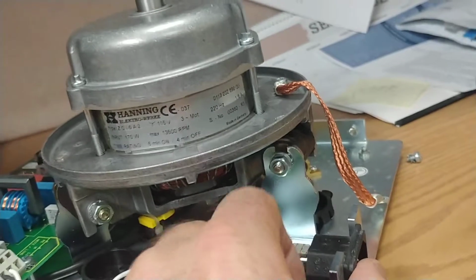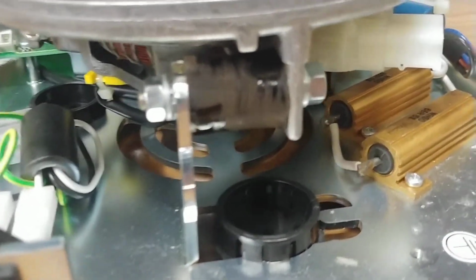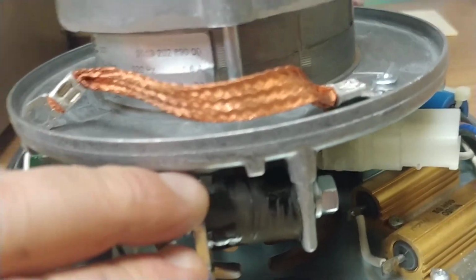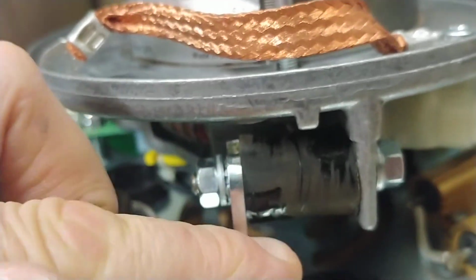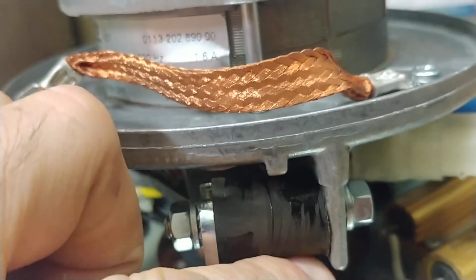So the reason why this was shaking was, now you see this back one looks shiny. Because I used super glue. The rubber had cracked here and here. Now the rubber up here was not cracked yet, so now under normal, you see this, I flipped it 180 degrees, so the part that was cracked used to be up top, so the weight, you can understand, would crack it here and crack it there.